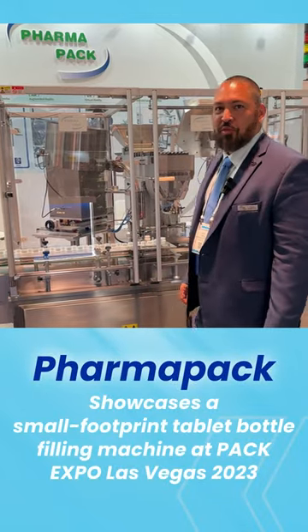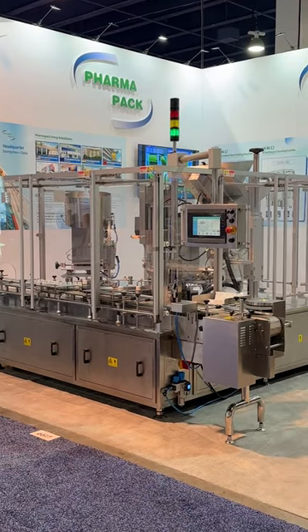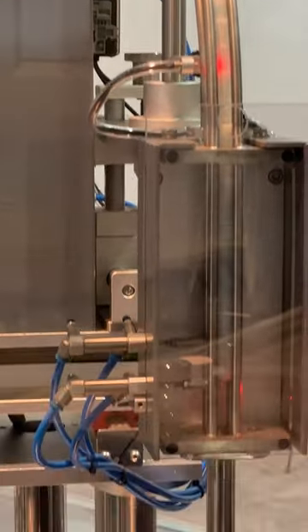Welcome to PAC Expo Las Vegas 2023. Let me show you our monoblock machine. This is a three-station monoblock machine. The first station has the canister desiccant inserter.